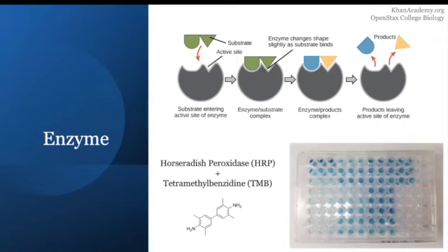Now, these reactions are kinetic, and they will progress over time, with a light blue color in the beginning developing to darker and darker blue. So we most often stop the reaction at a point where our samples fall within our standard curve. That part is really critical for valid ELISAs. And we stop it by adding acid. The acid denatures the enzyme protein and turns the color yellow.